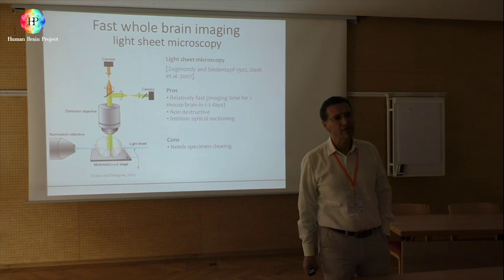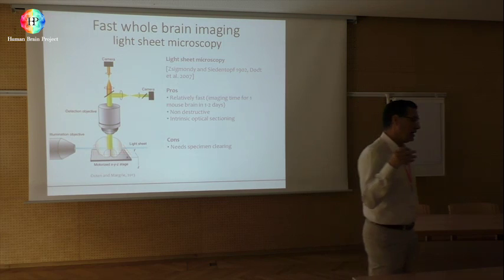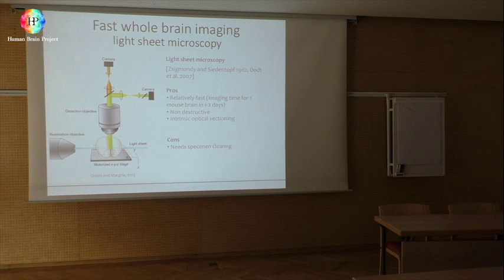No, I don't say 2 months. I say that 24 hours can be for the hippocampus. If you want to do the whole brain, 2 months is the whole process: imaging, stitching, and all the stuff together. But the imaging can be 1 week, for example, for the whole brain with 2-photon microscopy. One month is the whole process.